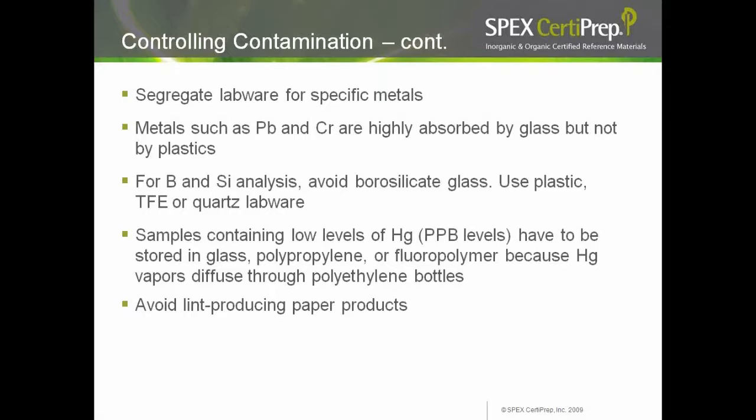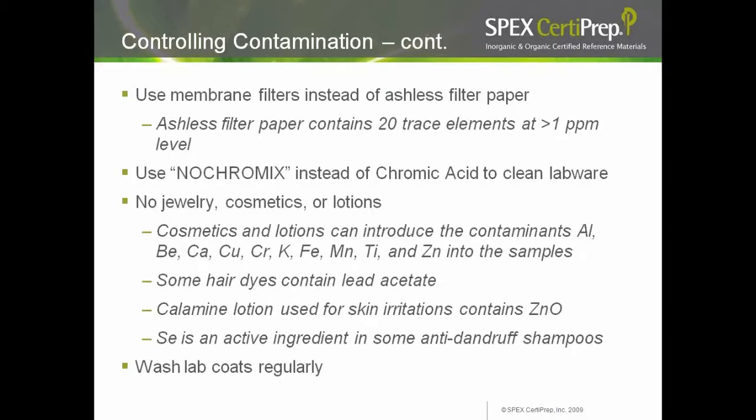Samples containing low levels of mercury, especially at ppb levels, must be stored in glass, polypropylene, or fluoropolymer because mercury vapors diffuse through polyethylene bottles. Avoid lint-producing paper products. Use membrane filters instead of ashless filter paper — ashless filter paper contains 20 trace elements greater than 1 ppm level. Use no-chrome mix instead of chromic acid to clean labware. Do not use jewelry, cosmetics, or lotions — cosmetics and lotions can introduce aluminum, calcium, copper, chromium, potassium, and other contaminants. Some hair dyes contain lead acetate; calamine lotion contains zinc oxide; and selenium is an active ingredient in some anti-dandruff shampoos. Wash lab coats regularly. Algaecides used in swimming pools contain copper — so if you come to the lab after a morning swim, you may increase copper contamination.